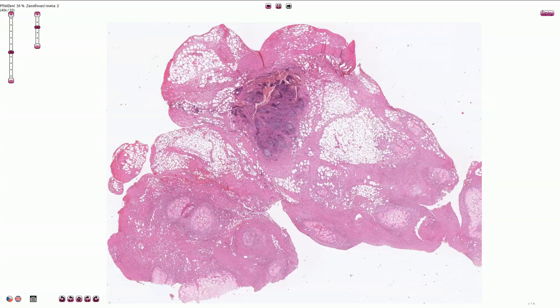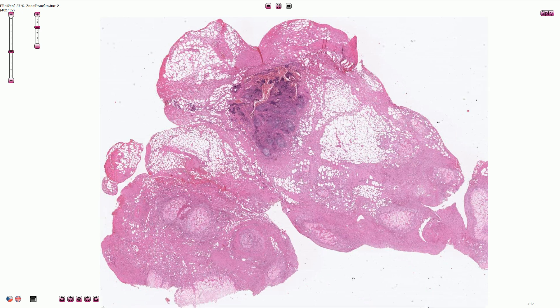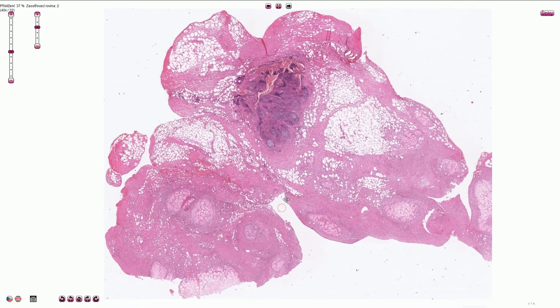In acute pancreatitis, we can sometimes find multiple fat necrosis in the peripancreatic adipose tissue. Here we see how fat necrosis looks like under the microscope.